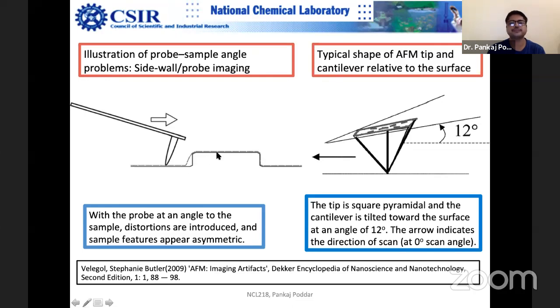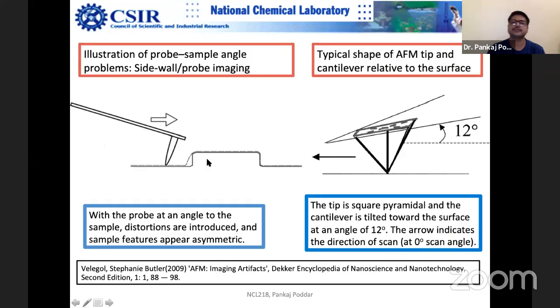Although vertical resolution is quite good, you can see convolution in the lateral dimension. The tip is approaching from one direction, so it is always good to scan both ways. This is the typical shape of the AFM tip relative to the surface, and this is the typical tilt angle.